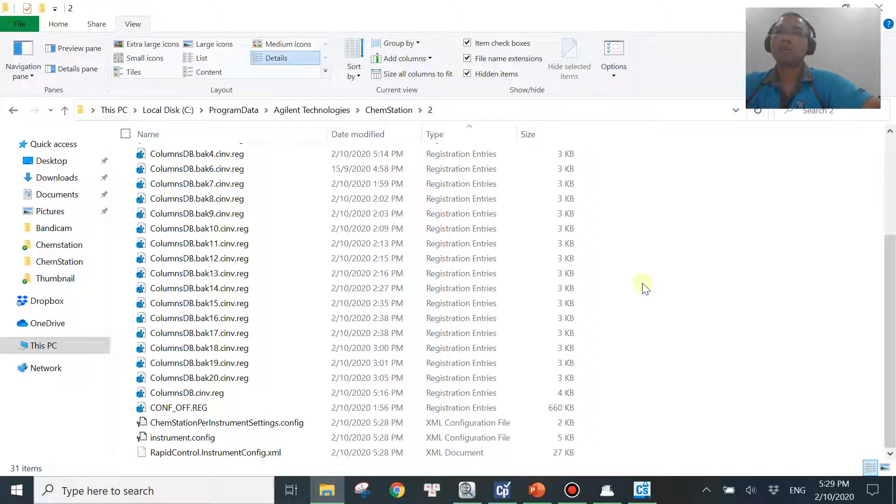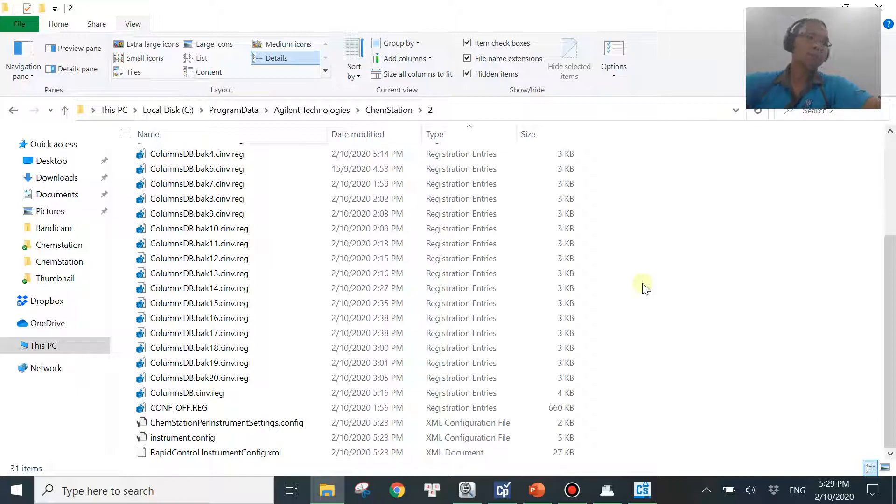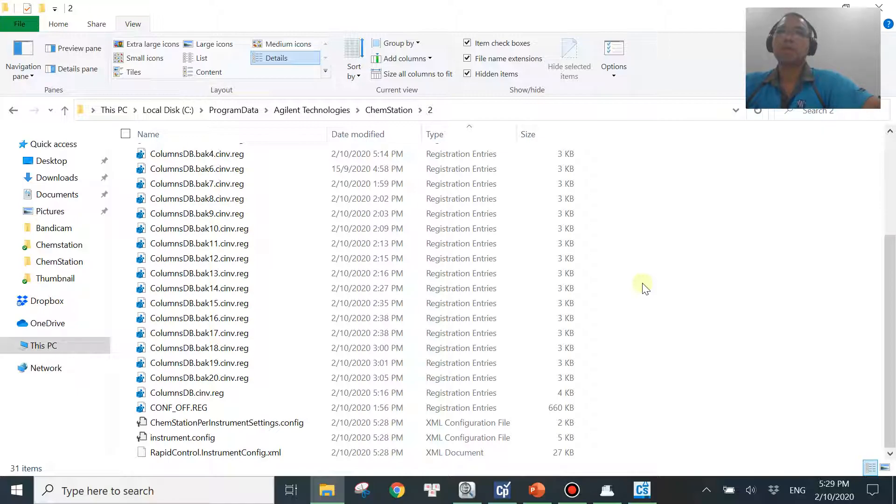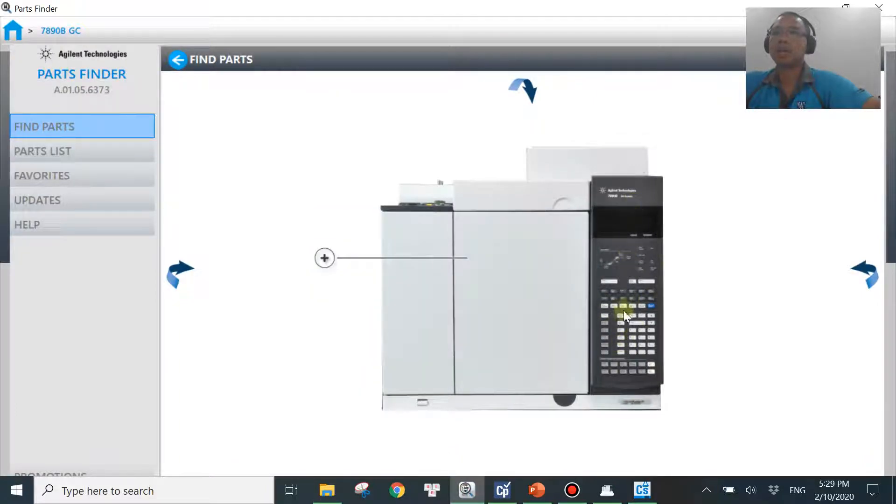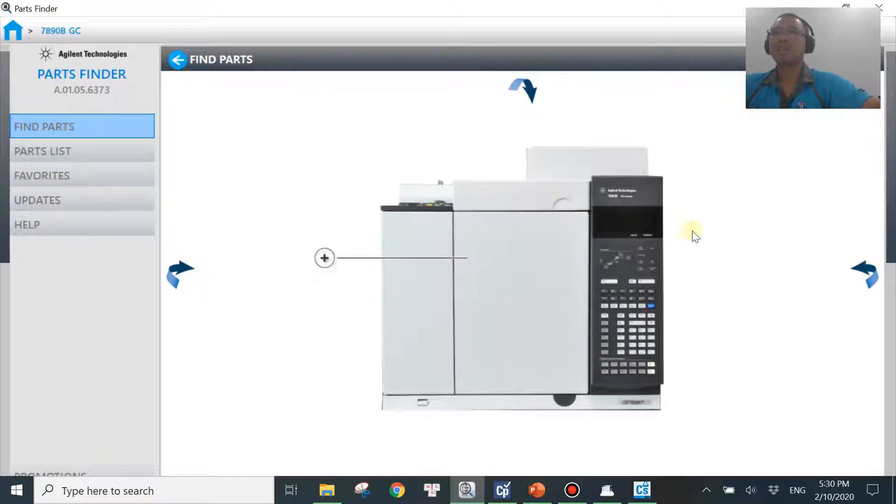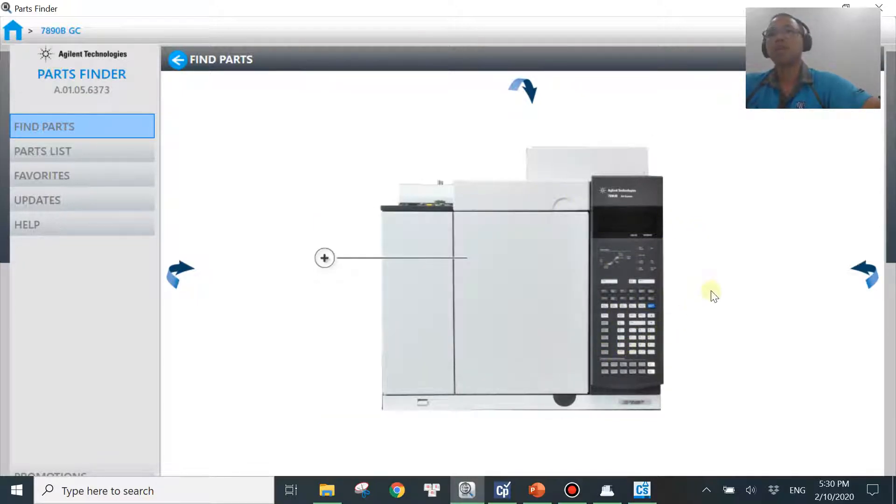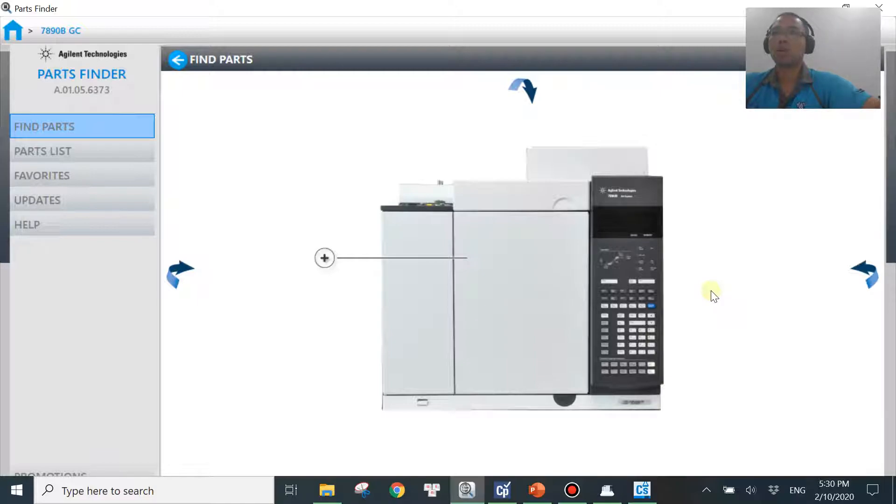So let me know in the comments if you have any problem to fix this problem or even if you have problem to find out the IP address of your GC model, because the one just now I showed you was 7890. And if you are using another model like 6890 or even 8890, the newest model, there's no keyboard over here. If you don't know how to find out the IP address, let me know in the comment. I will show you that.